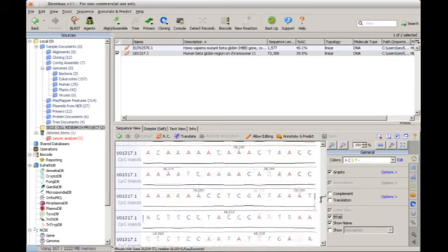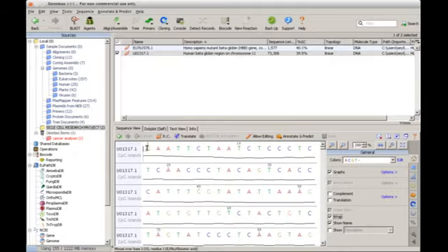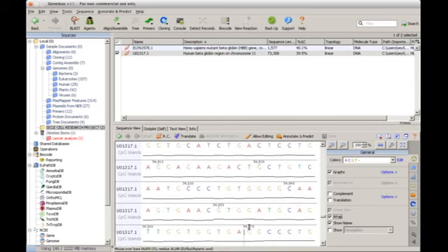As you can see, this is 1, this is 10, this is 30, this is 50. So from here to this place is 50, and from here to this place the whole nucleotide sequence there is 80. If you keep going, from number 1 to this place, we have about 54,870 nucleotide bases.